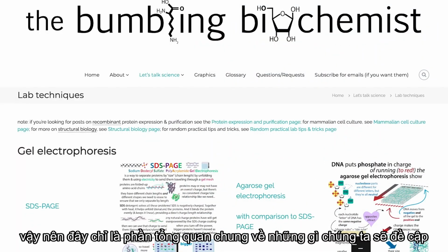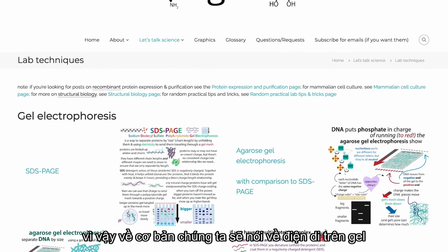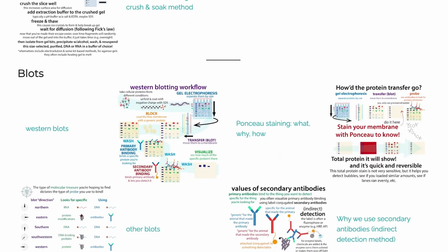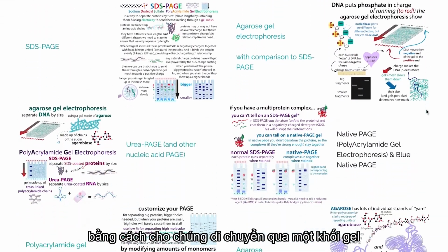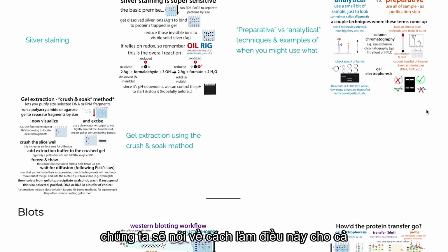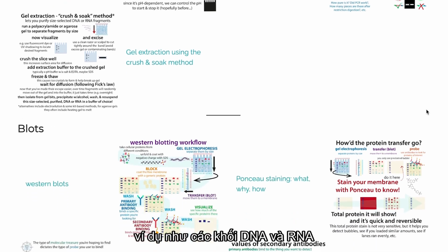So just a broad overview of what we're going to be going over, and then I will go through and make timestamps and put them in the comments so that you can jump to the parts that you're interested in if you want. So basically, we're going to go over gel electrophoresis, which is a way that we can separate molecules based on size by sending them traveling through a gel. We'll talk about how we can do this for both proteins and nucleic acids, so for like DNA and RNA.